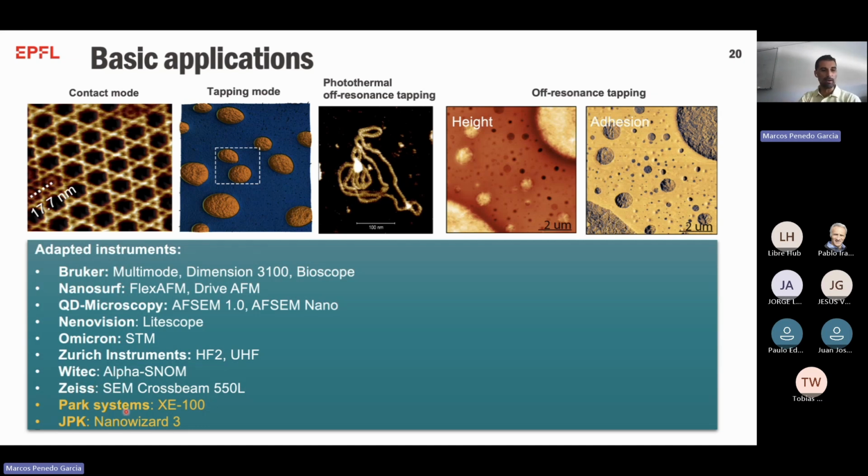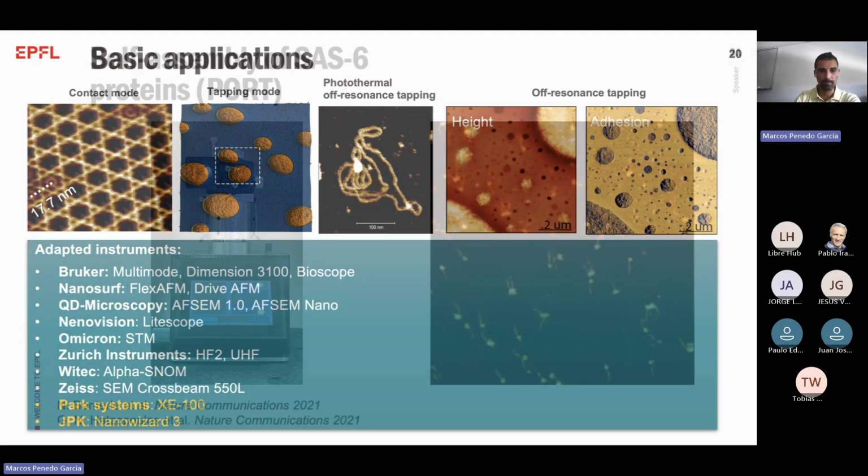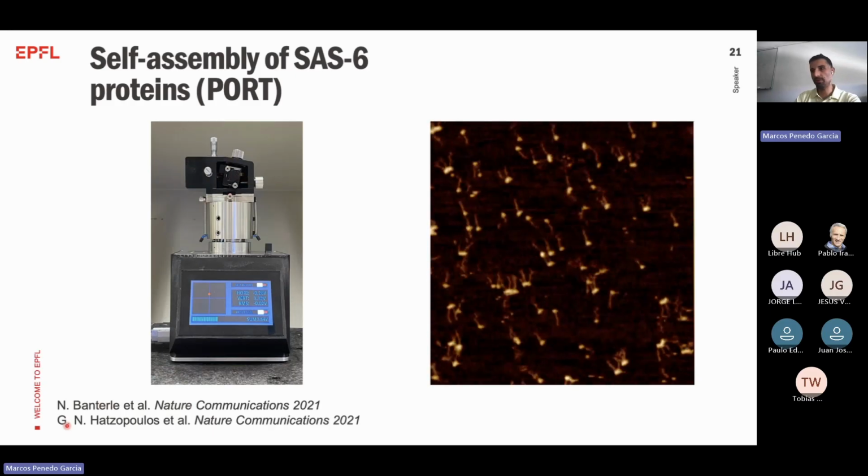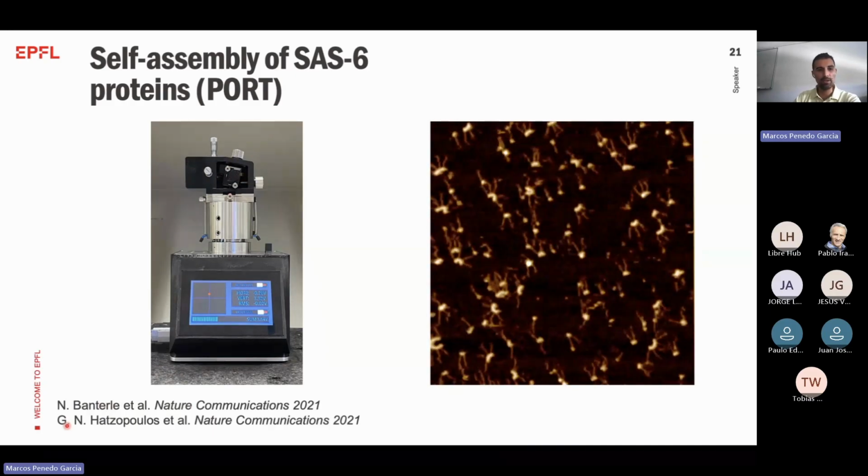And what we're doing now is trying to adapt our system to Park and to JPK, that are also important brands in SPM. Okay, just to show you a few samples of what we do here in the lab.